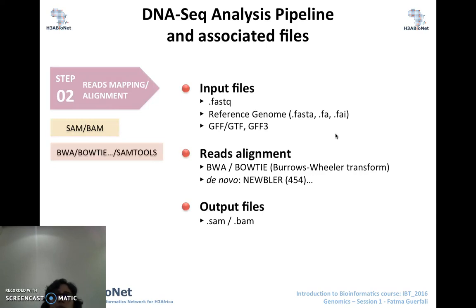Then you would also need algorithms to align or map these reads to the genome.